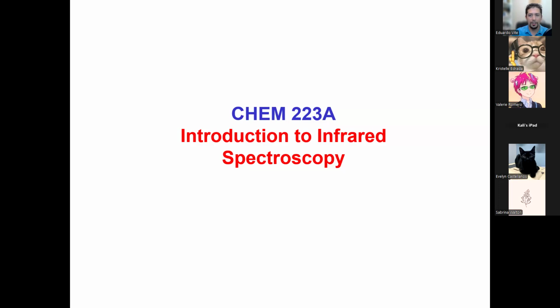We are meeting to talk about infrared spectroscopy, more specifically, the introduction to infrared spectroscopy. Last week, I gave you a small preview where I told you that molecules are not standing still. They're actually moving in many ways. They're rotating, they're translating, and they're vibrating. Specifically, the bonds of the molecules are vibrating, and you have your little water yoga dance, you know? Next big thing, I promise you.